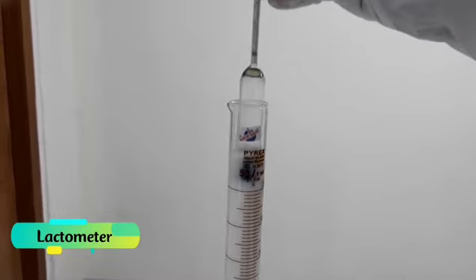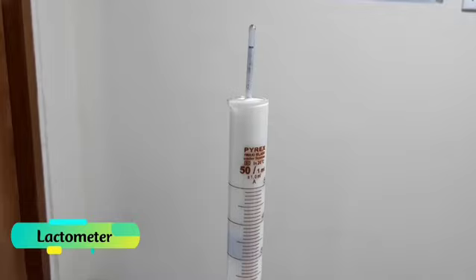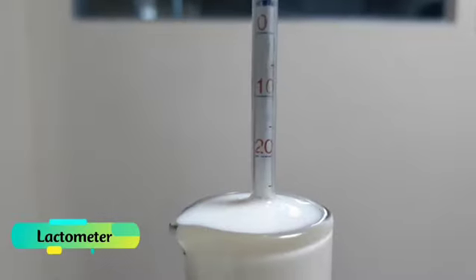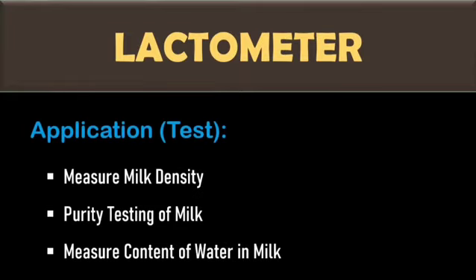It detects the adulteration of milk with water, it controls quality in the dairy industry, and it is used in laboratories for routine milk testing. The advantages are low cost, ease of use, and quick results. Lactometer application test: it measures milk density, tests the purity of milk, and measures the water content in milk.